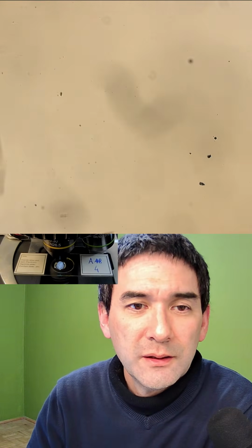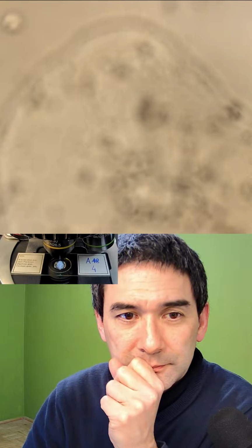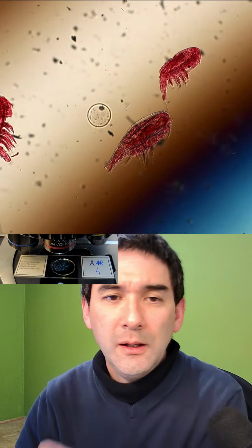Let's see if I'm able to find them. Dust and dirt all over the place. Okay, let's have a look. Where are they? You always want to start with the lowest magnification first. So, here they are.